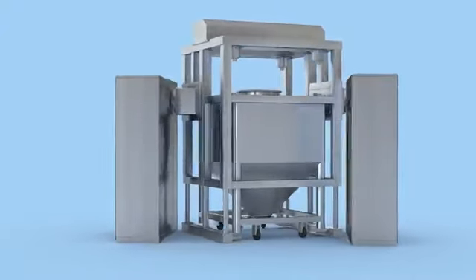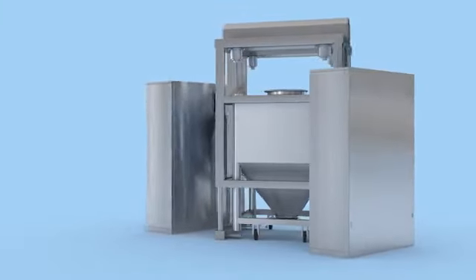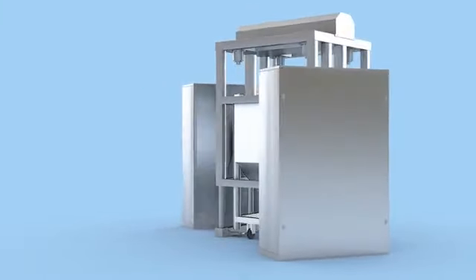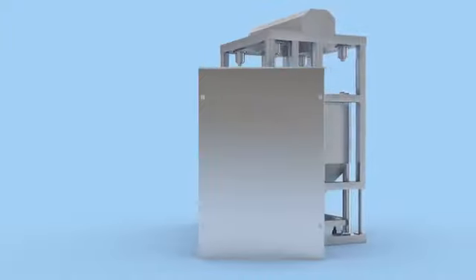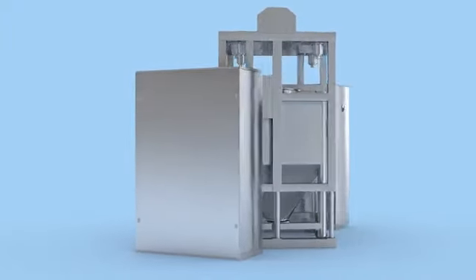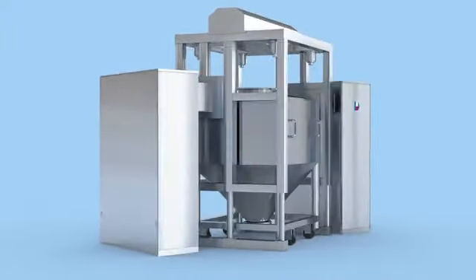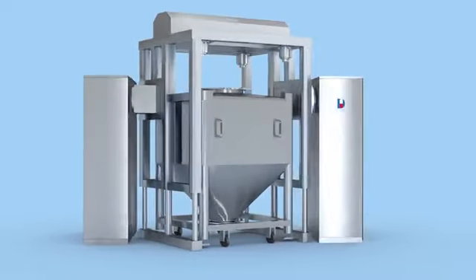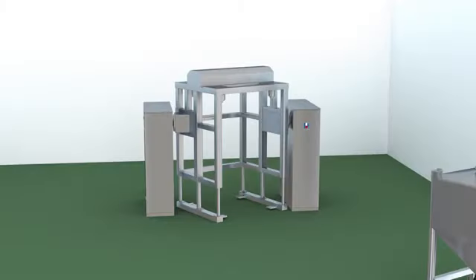It satisfies GMP requirements. The machine is equipped with PLC control system, built-in self-diagnosis system, multi-interlock system, and infrared safety device to provide safety and reliable operation.